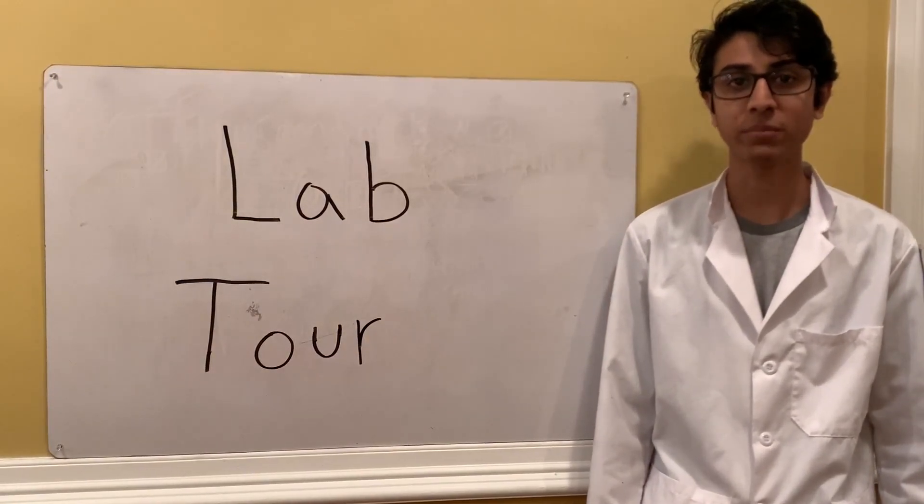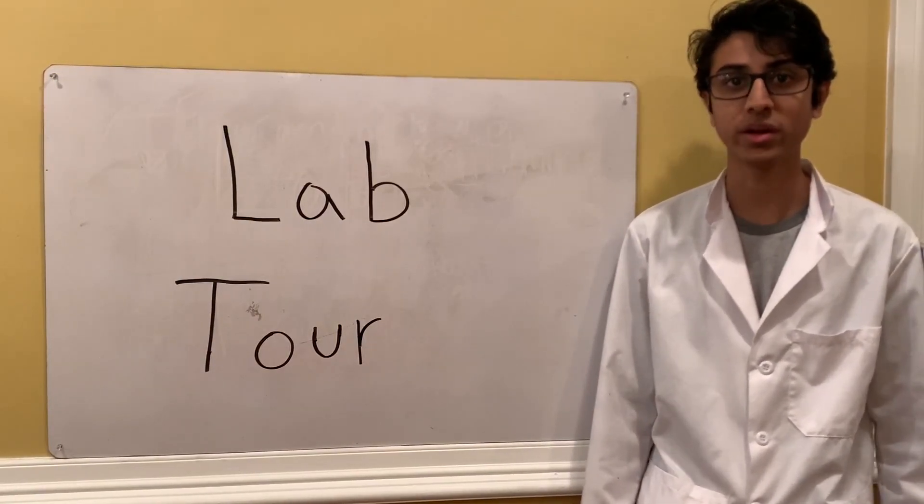What's up guys, welcome to Abad's Lab. Today I'm going to be showing you my lab and all the equipment I use in my videos.